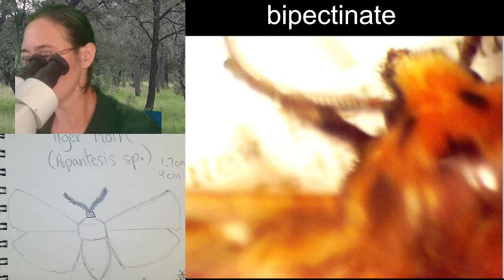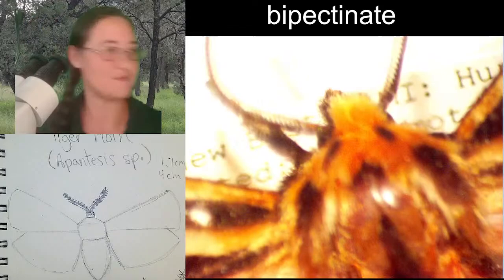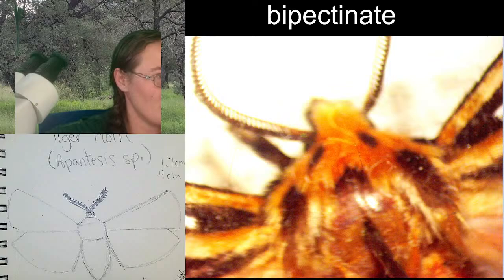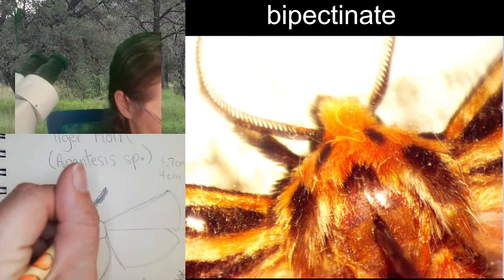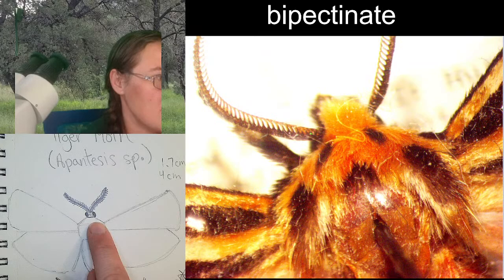Okay, there, now I can see the eyes. I rotated the specimen just a little bit because I was curious. We can see the compound eyes from this point of view. They exist right here, kind of behind the antenna. So what we could do is kind of darken two spots off to the left and the right. I'm okay with adding the antennae in there. But now that we are looking at it this way, it doesn't look as angulate.